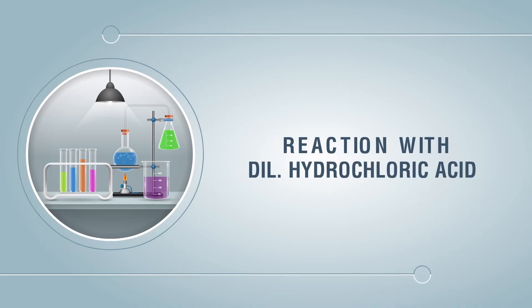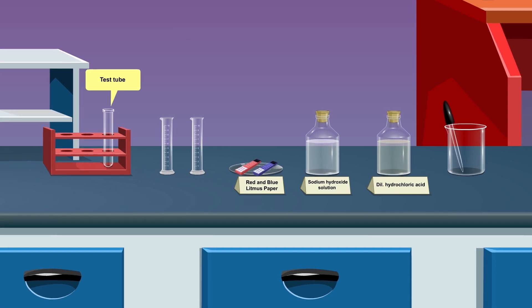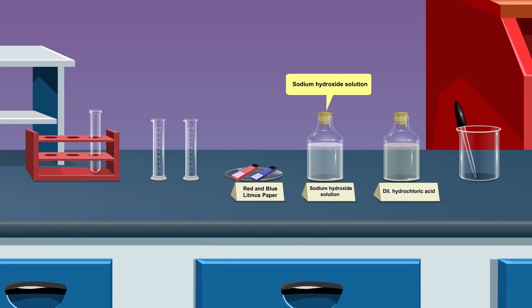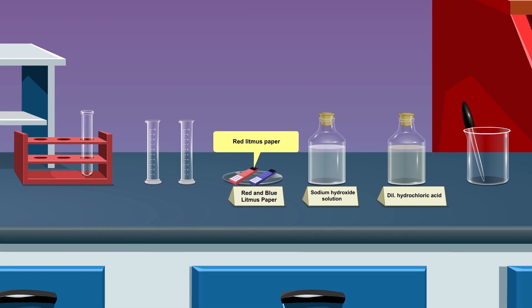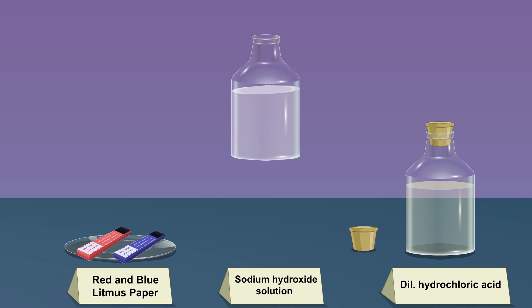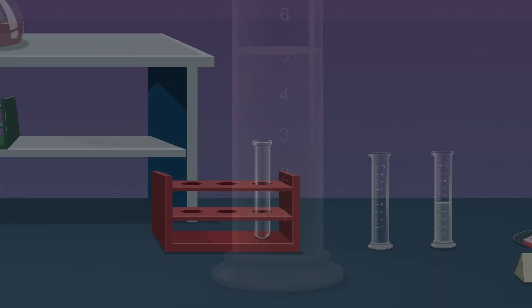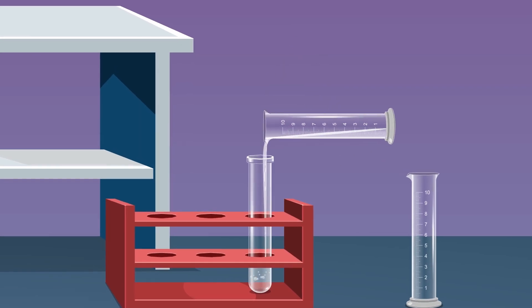Reaction with dilute hydrochloric acid: We require a test tube and test tube stand, measuring cylinder, dilute hydrochloric acid, sodium hydroxide solution, blue litmus, red litmus, and a dropper. Take 5 ml of dilute sodium hydroxide solution in a measuring cylinder and pour it into the test tube in the test tube stand.